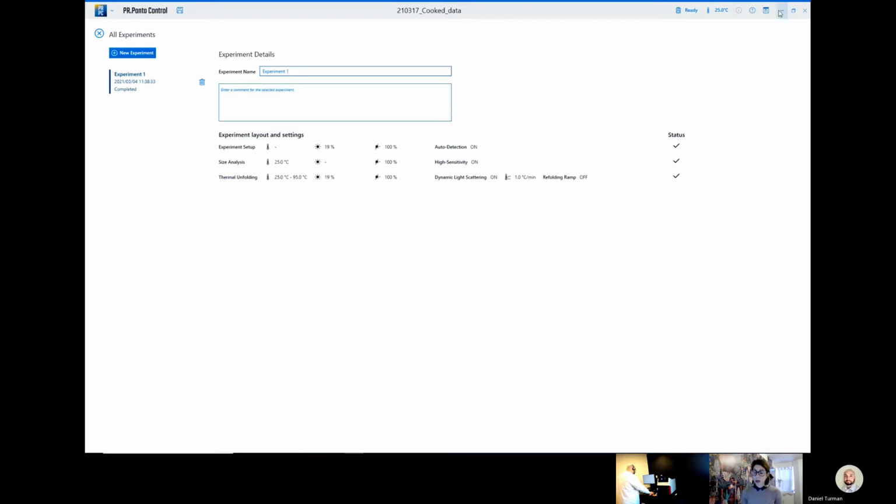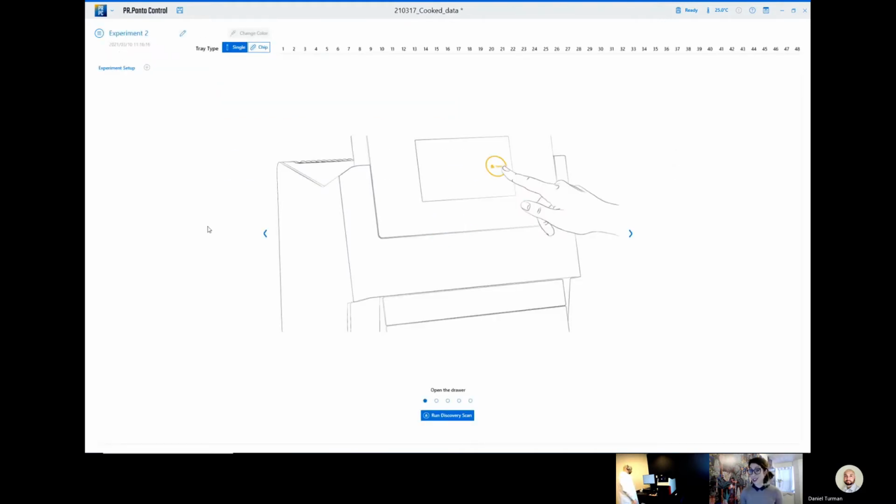And the other thing you want to be mindful of, and this is specific to DLS measurements, is that nano DSF is a bit more of just load and go. But since DLS is so sensitive to particles in solution, you want to make sure you cover any of your pipettes or plates that you're going to be preparing samples in. Definitely. That's great practice to get in the habit of.